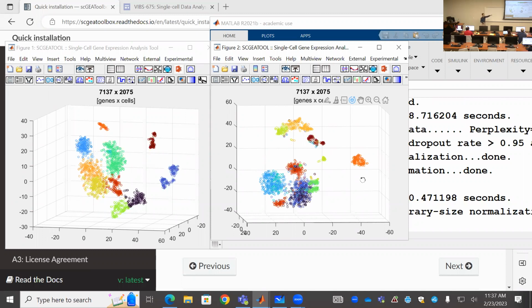On your left, the clustering is based on the position of the cells by their embedded coordinates. Well, on the right, I didn't give any position information, I only gave their expression profile and let SC3 cluster cells into groups.